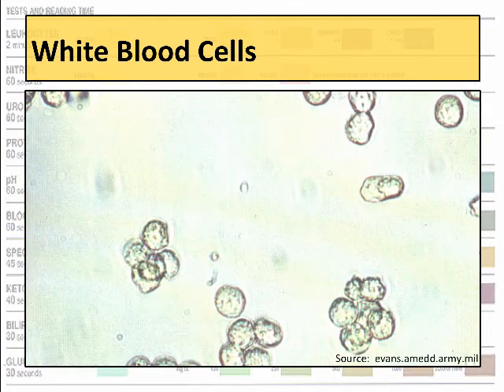On that same note, we have white blood cells. And different from red blood cells, they're going to be larger. They're not going to have a reddish tint. And one of the things you can kind of see is that they have granules inside of them. They're full of pockets of chemicals. And what they have are little lysosomes with digestive enzymes in it. So if you're lucky, you can see the granules, and that's really going to help you identify this as a white blood cell or leukocyte, another name for it.